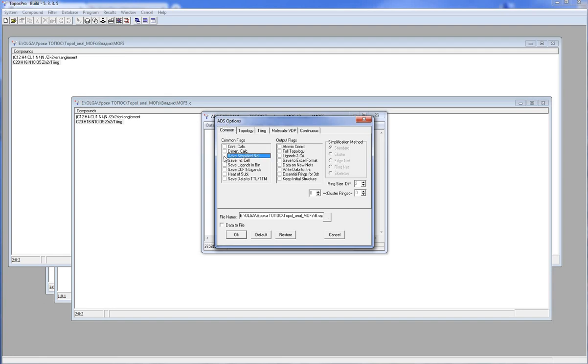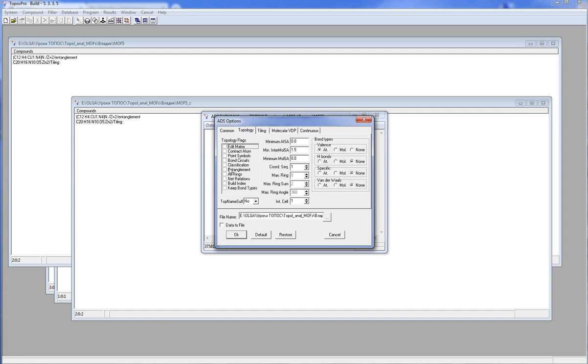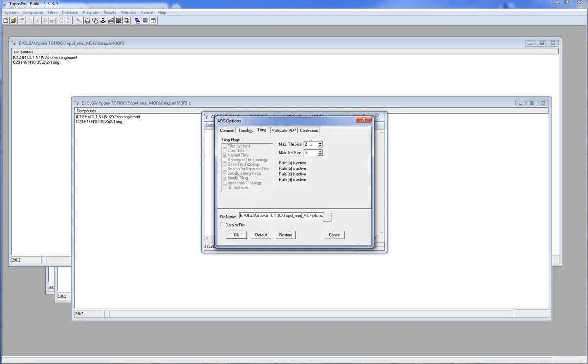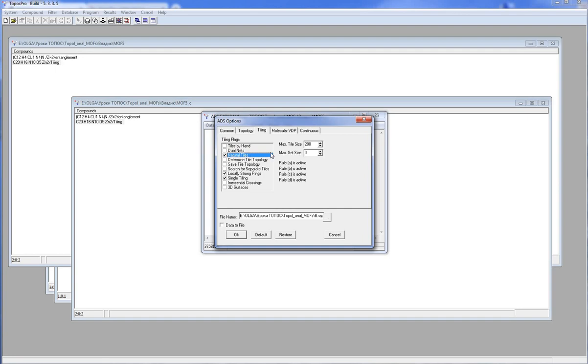I run ADS, Options, Topology. I have to set the All Rings option, then set maximum ring equal to 12, that is enough for most structures. If you set too small maximum ring and no proper tiling can be constructed, then you should increase the maximum ring size. Then I switch to the Tiling tab. I have to specify the maximum number of the tile faces. The maximum tile size, 200, is sufficient for most nets. I should check the Natural Tiles option. As you can see, the options Locally Strong Rings and Single Tiling turn on automatically. These three options ensure that the tiling obeys the natural tiling rules.